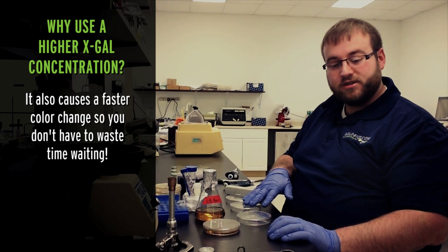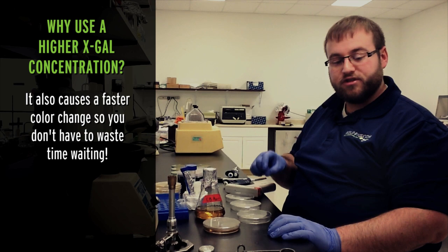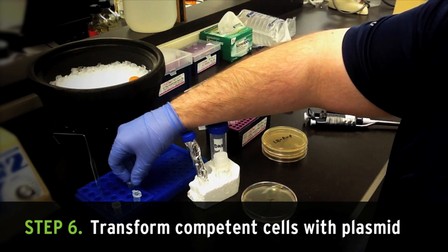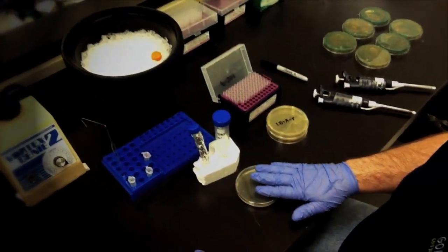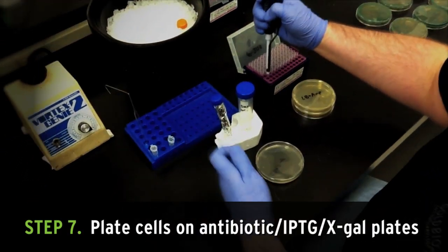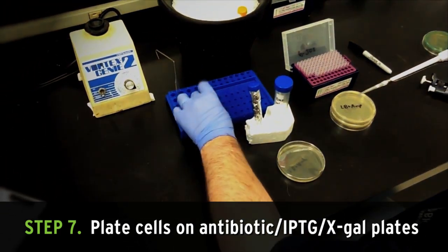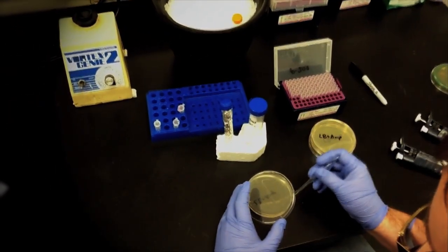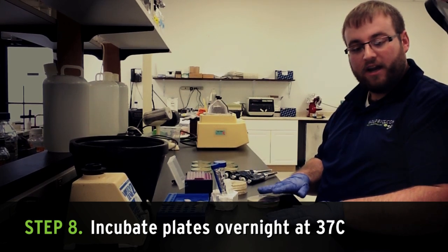The higher concentration will also allow that color to develop faster, with good interpretable results available after just an overnight incubation. Transform the competent cells with your cloned plasmid following the transformation protocol appropriate for your cells. Once your pre-poured or top-spread plates are dry, plate an appropriate amount of cells onto the antibiotic IPTG X-Gal plates. Once those are dry, place in a 37 degree incubator and incubate overnight.